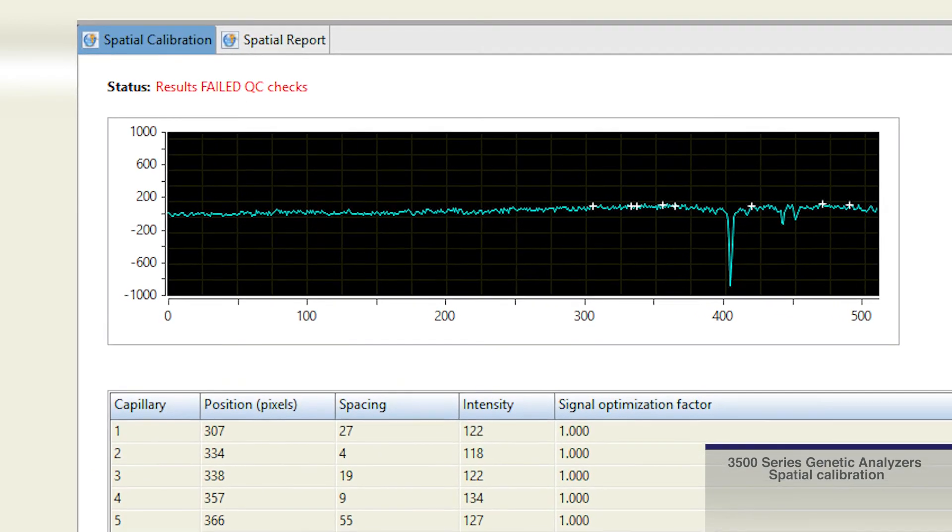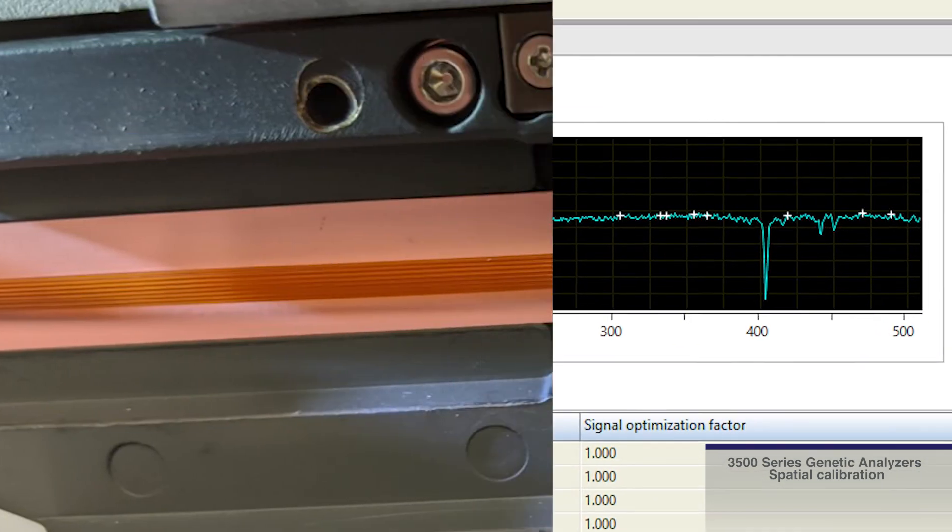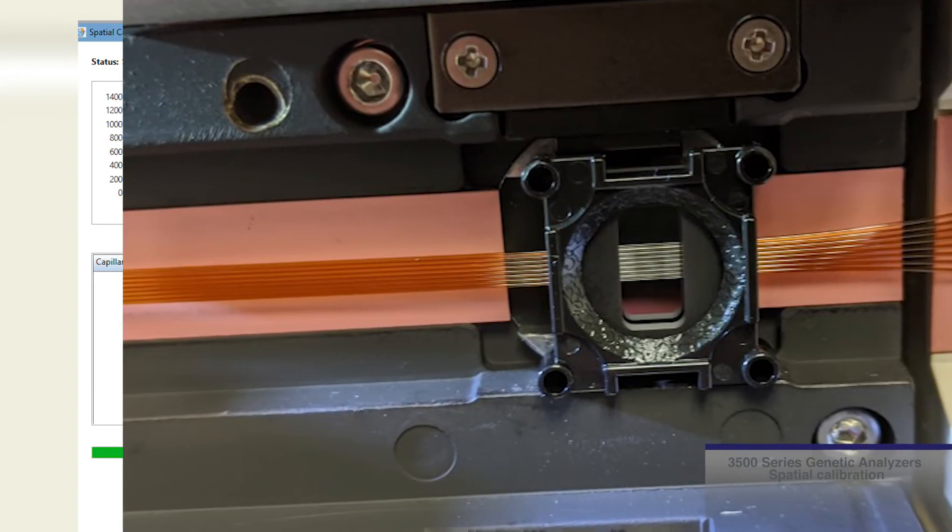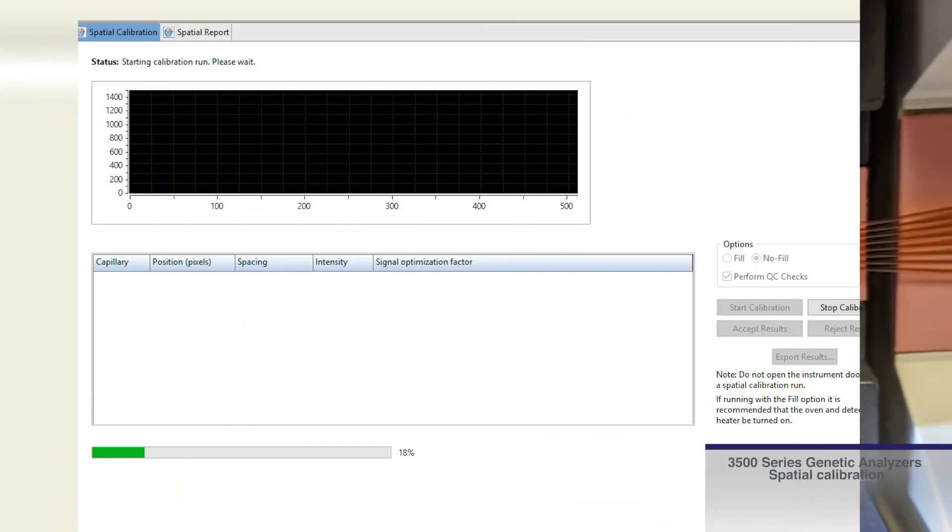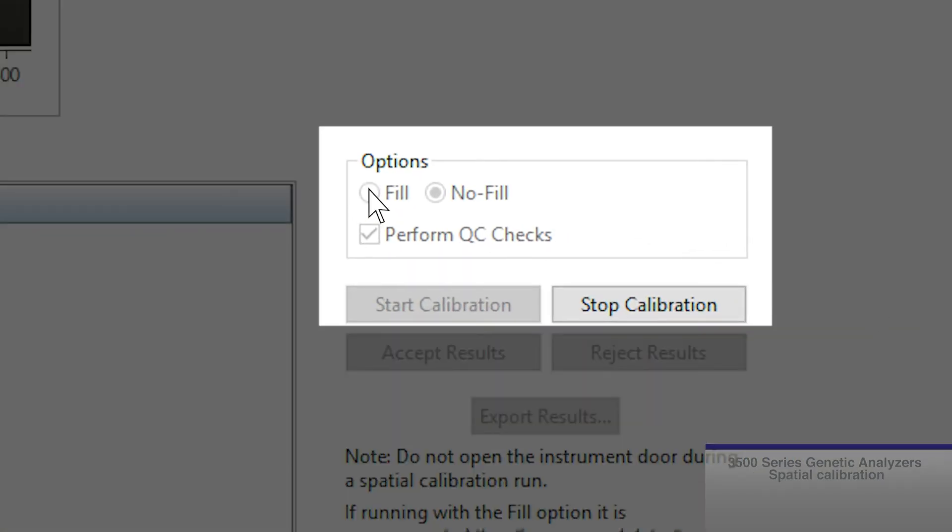If the spatial calibration has failed, check to see that the detection cell is seated properly. Select the fill option to fill the capillaries with fresh polymer and repeat the calibration.